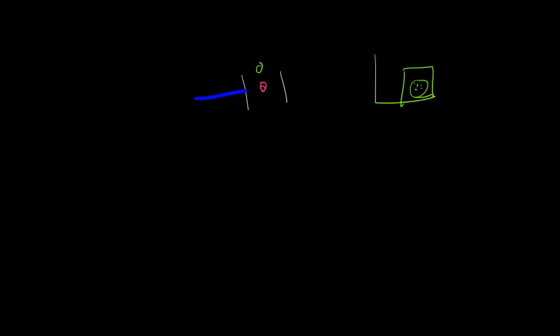We make a decision. First we detect the cell, whether the cell is of my interest or not, and where the cell is coming. The moment it is detected, what happens to the cell after the detection is done? The cell moves. The cell is not stagnant, it is flowing.